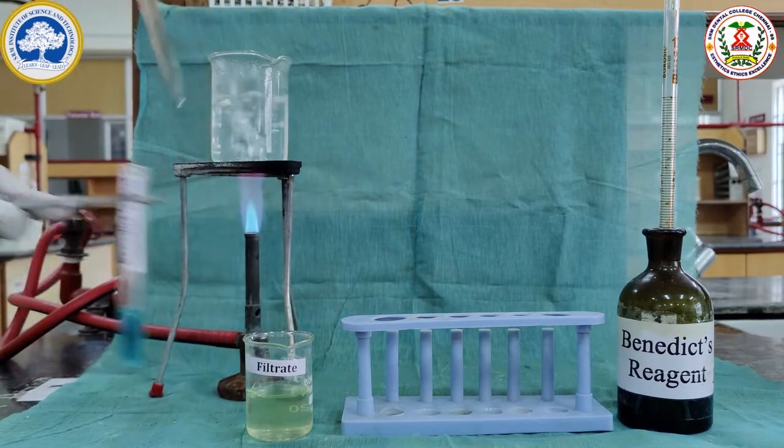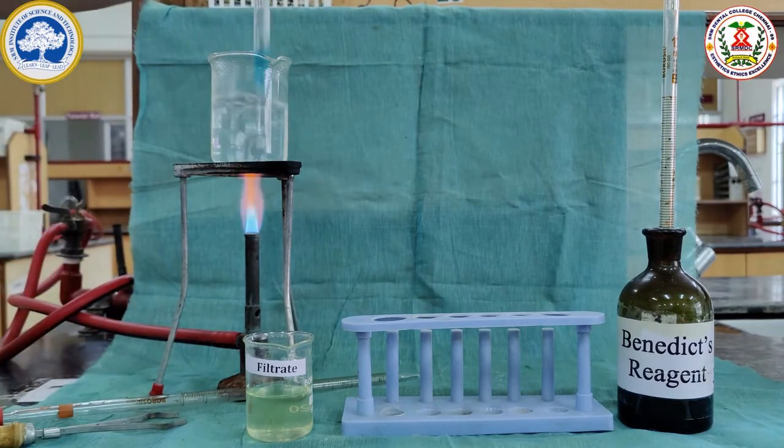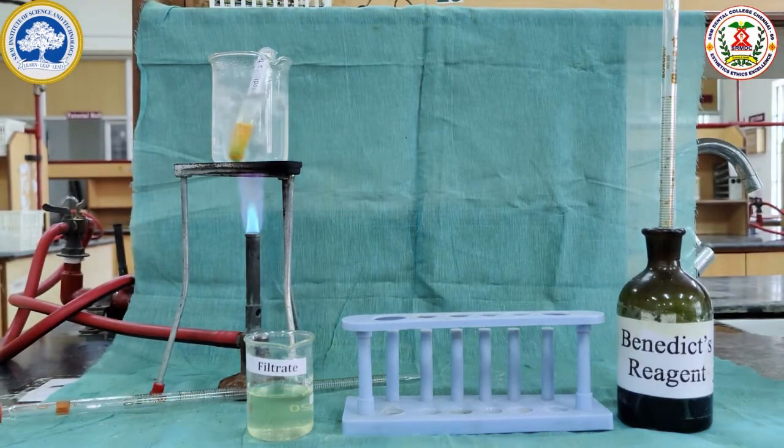and it is kept in the boiling water bath. Benedict's reagent contains cupric ions, which are reduced to cuprous ions. Here we can see the change of blue color to brick red color precipitate, which shows the presence of reducing sugar. After 2 minutes, it will change into brick red color precipitate. So this shows milk contains the reducing sugar lactose.